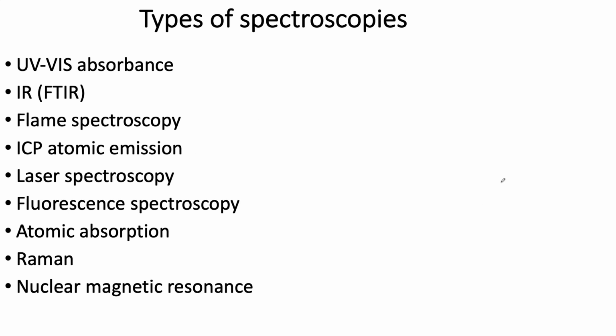All right, so these are just a list that I happen to come up with. There isn't a finite list of different spectroscopies, but this just gives you a flavor of the kind. And there's some overlap here. So we talked about UV visible absorbance. All right. Well, that turns out to be, at least for spectrophotometry, one of the most common techniques.